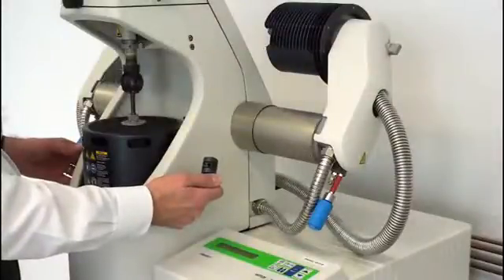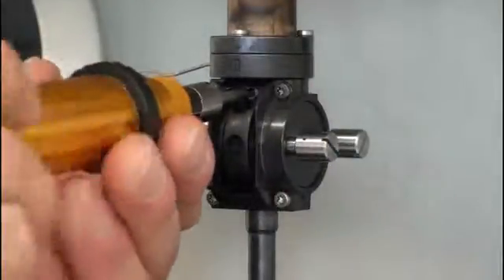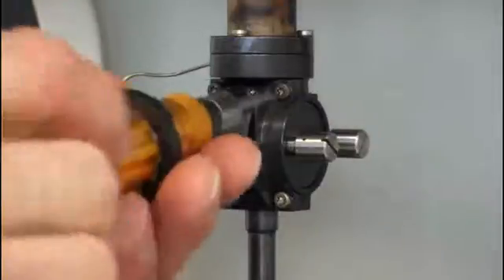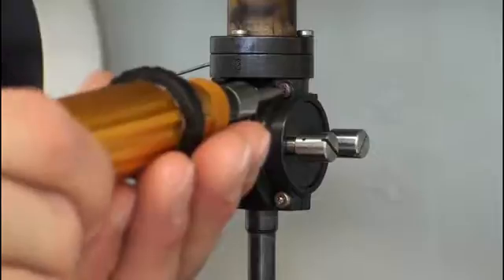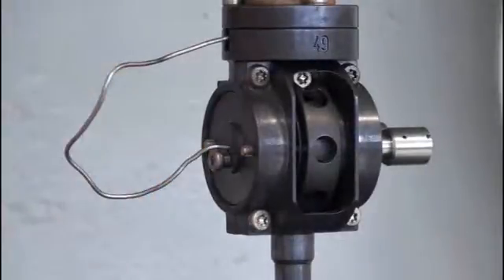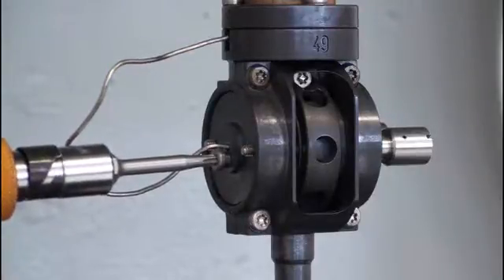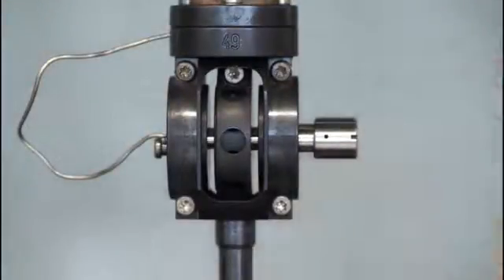Once the sample is clamped, we insert it into the clamp assembly. Before we can close the furnace we have to remove these two screws.